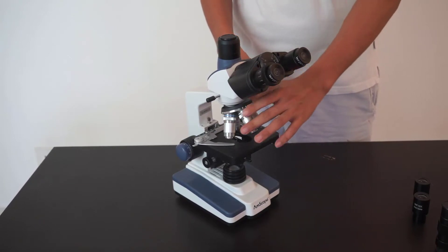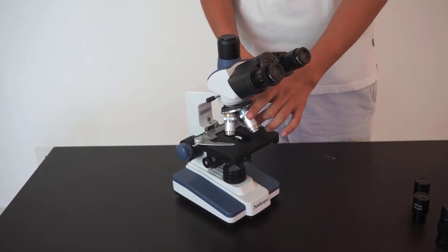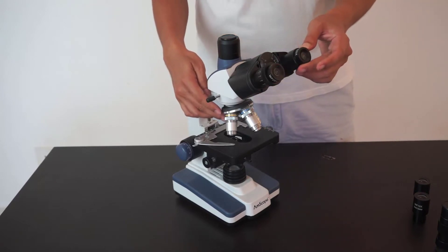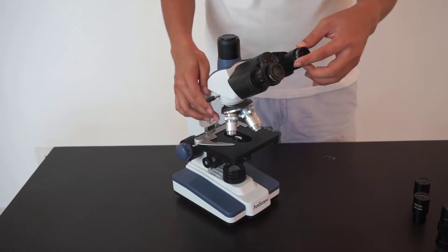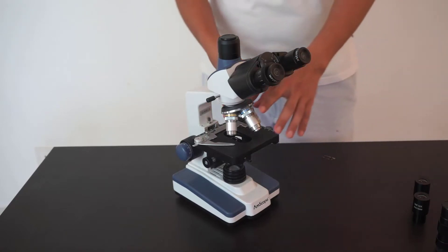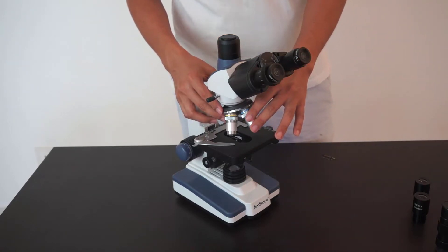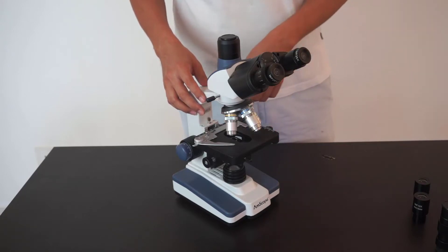Each objective has a magnification. To get the magnification that you want, right here we have a 25 times eyepiece and a 4x objective, so I will be getting a 100x magnification on this eyepiece and objective.